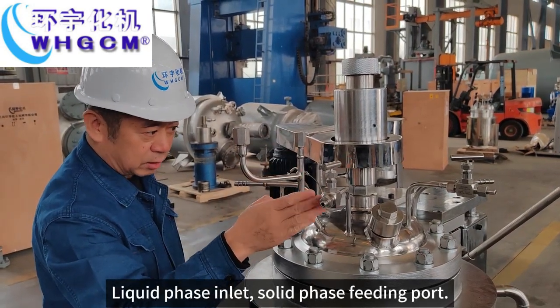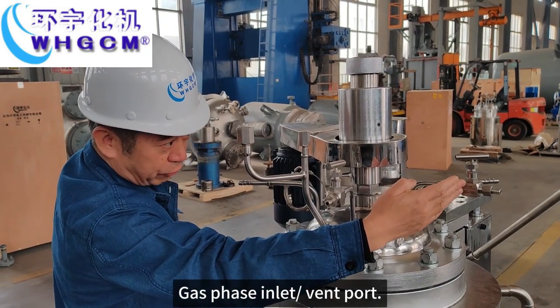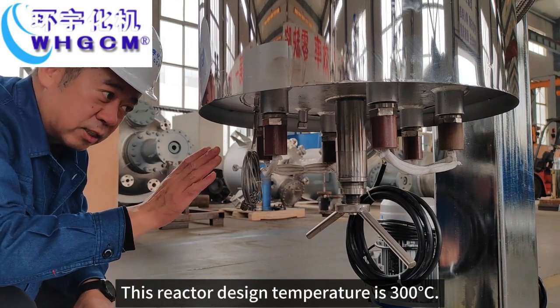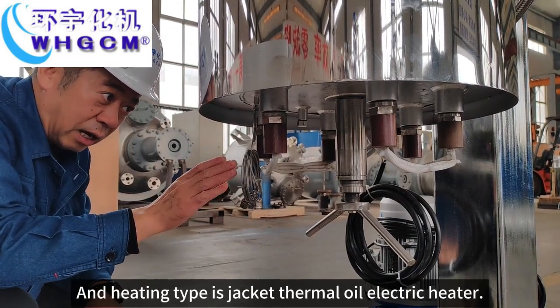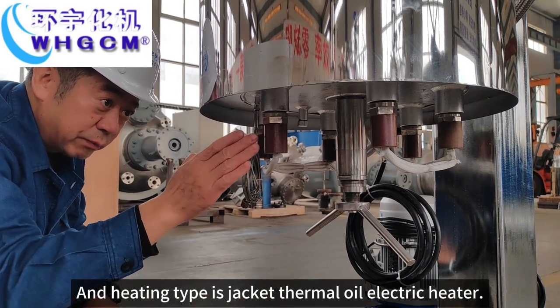Liquid phase inlet, solid phase fitting port, gas phase inlet and outlet port. This reactor design temperature is 300 degrees, and the heating type is jacketed thermal oil electric heater.